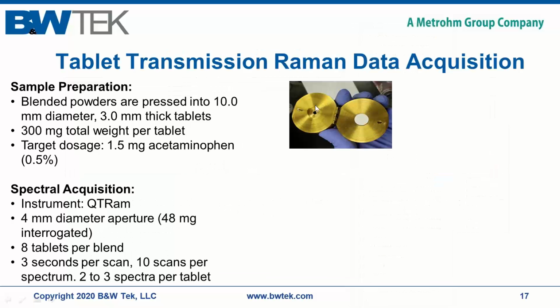So this is the tablet put into the sample holder. That's the tablet as it is, no additional preparation of that material. And if we were measuring powders, we could measure those in a plastic bag, and we could measure those directly. This can be done with powders, but again, the sample holders are optimized for tablets.